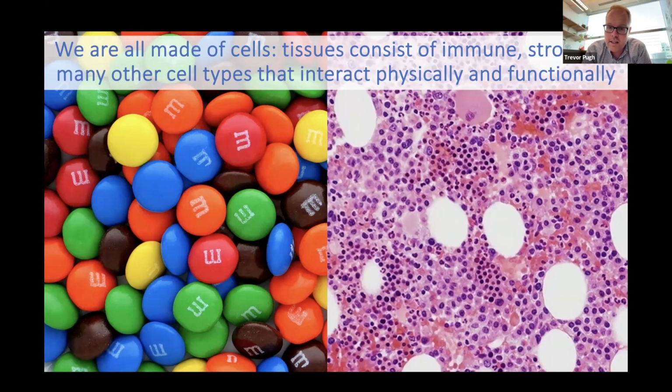Or are you really just interested in quantity of cells, proportions of cells, and trying to infer cell-cell interactions without knowledge of the structure? And for a lot of the scientific questions you want to answer, the structure really may not matter. So I would caution groups from just trying to jump on to the latest spatial transcriptomic methods, where conventional droplet-based methods may be totally fine to achieve your scientific goals.